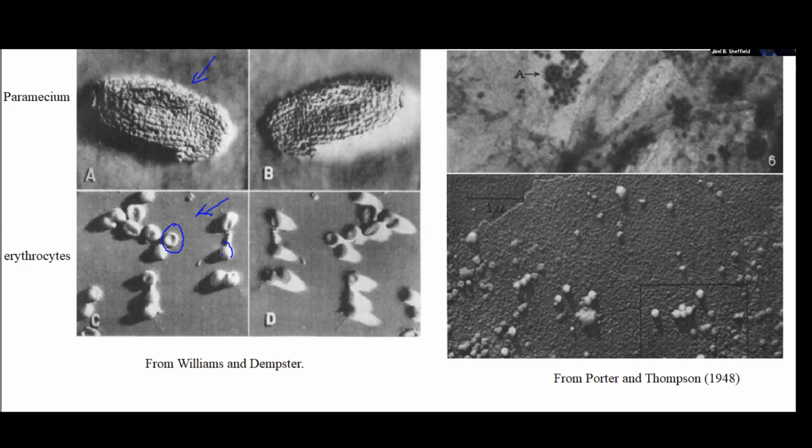But in fact, it was being used. This is 1948, before a lot of the techniques were available. Keith Porter, whose name you'll hear a number of times during the next few lectures, started to look at cells that might be making virus. He was particularly interested in the idea that certain viruses, especially those that caused cancer, would cause cancer, and that those viruses could be visualized.